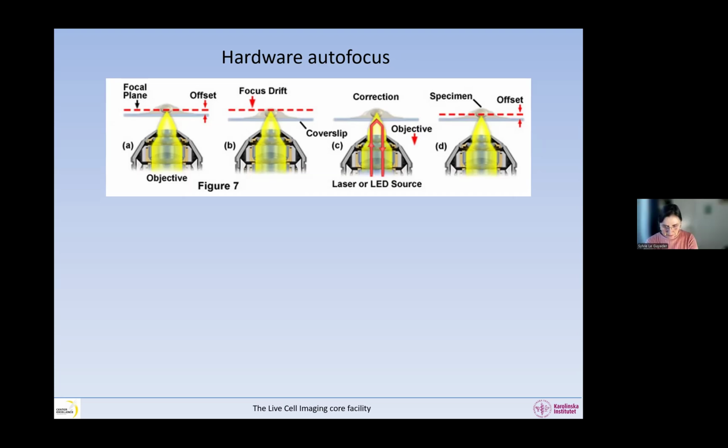Okay, so so far I haven't moved. I'm in the same place. You can stay in the same place, but use some oil on the water objective. But you need to ask Leica. Okay, thank you. If they have such an oil, you explain to them that you don't want the water to evaporate.